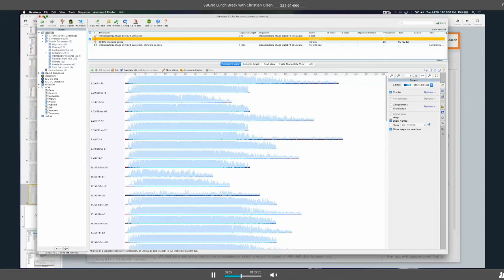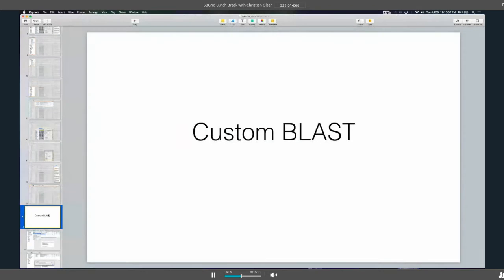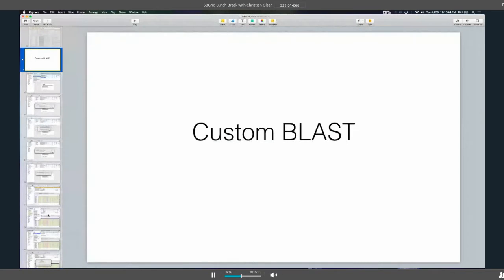Okay, with that in mind, let me go back to my presentation and talk a little bit about custom blast. This was one topic of interest that we received some feedback on.